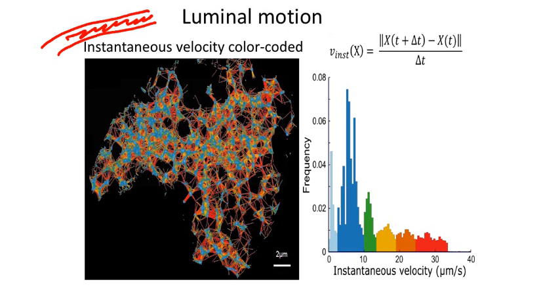And what we have found is that you can see clearly here two types of colors, indicating that there are two types, two regions. One in blue, which are the regions of high density, which are characterized by a slow velocity. And then we can see the red color basically between these regions of high density.